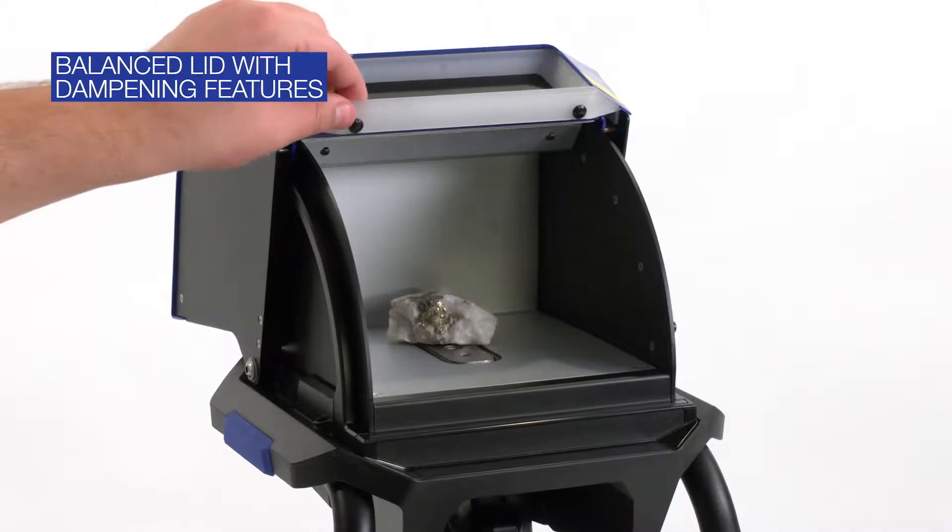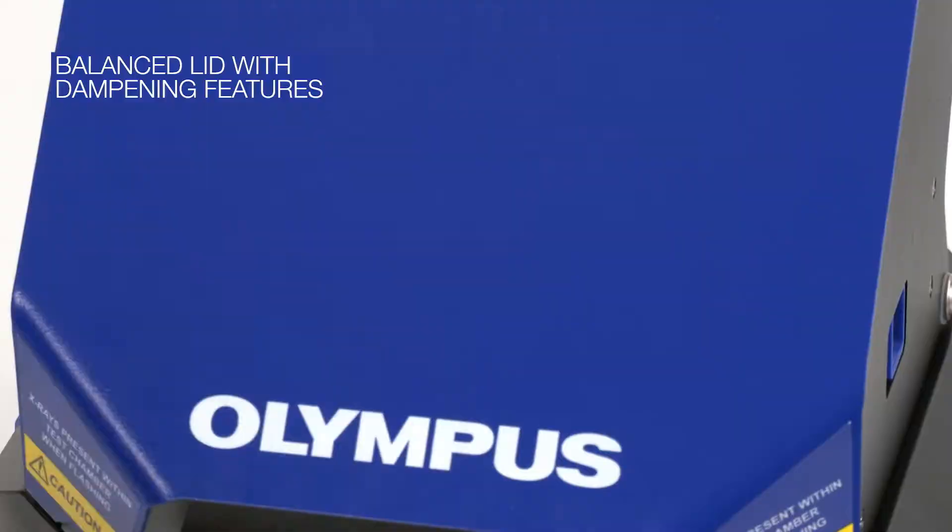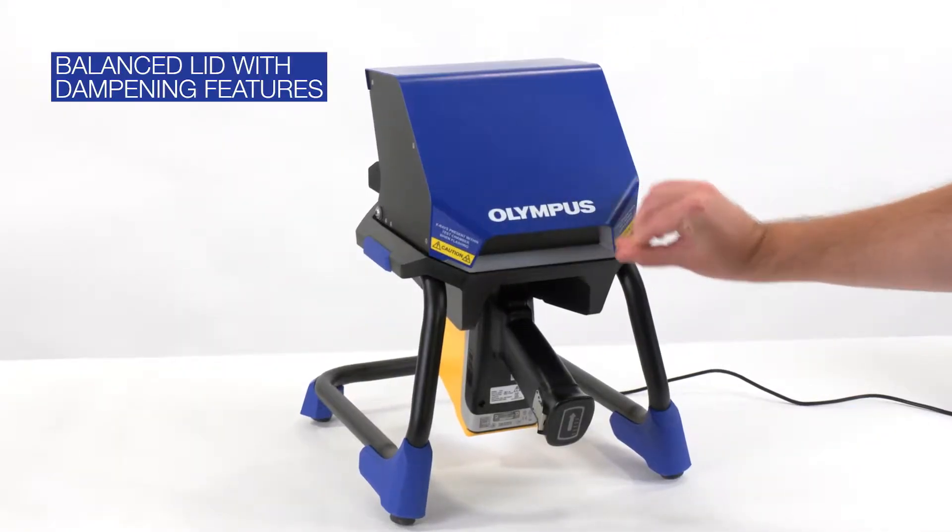The sliding lid easily opens and closes, so you don't have to lift its full weight. The lid is balanced and has dampening features to prevent slamming.